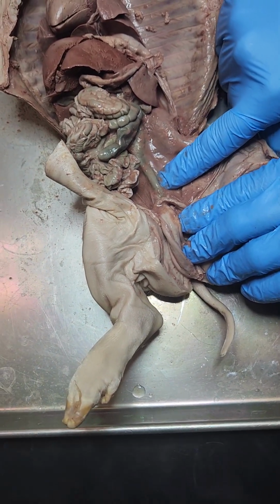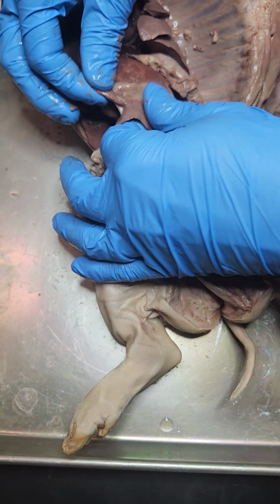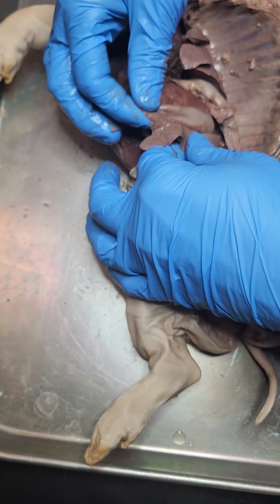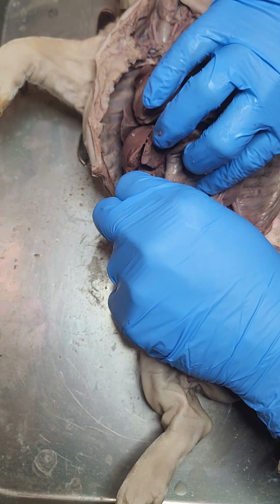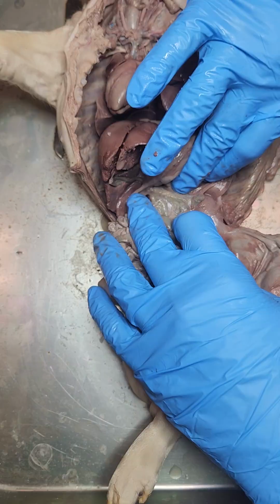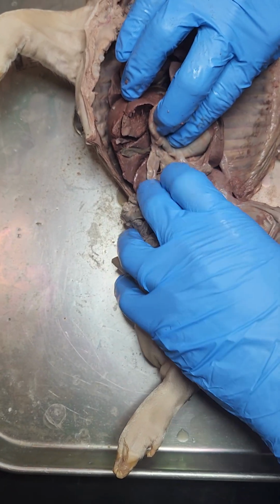Okay, it's descending colon. Spleen is right here. We find the stomach, and we find this like tongue-like organ flipped off to the side. That's a spleen. All right. Pancreas. Now, pancreas, what we do is we pull the stomach back, and we sort of move this around in here. And what we find is we find this sort of fatty-looking organ right here, and that's the pancreas. Sorry, I want to see this as well. Sure, that's fine. Cool. So that's a pancreas right there.